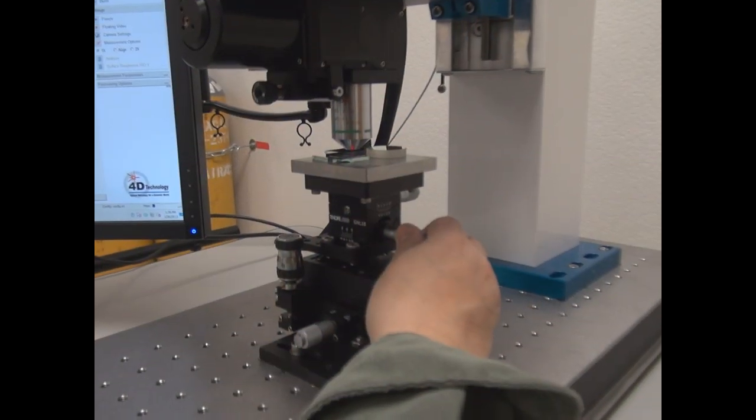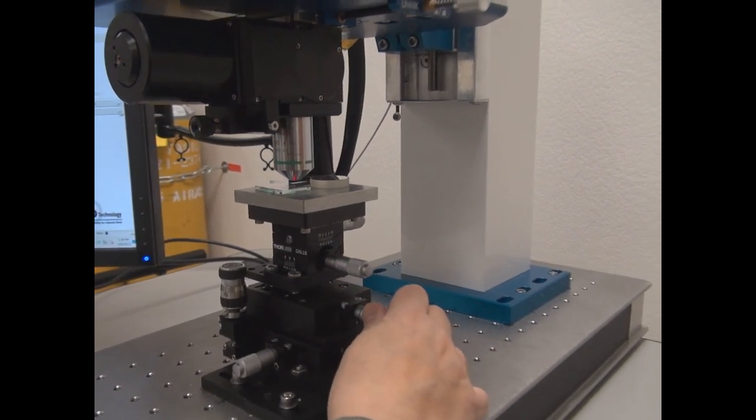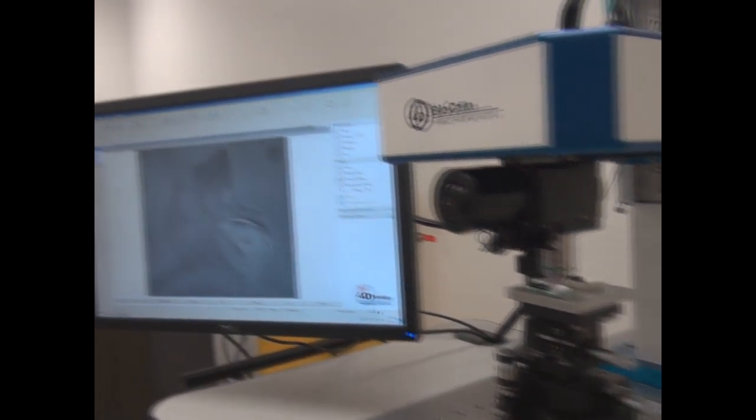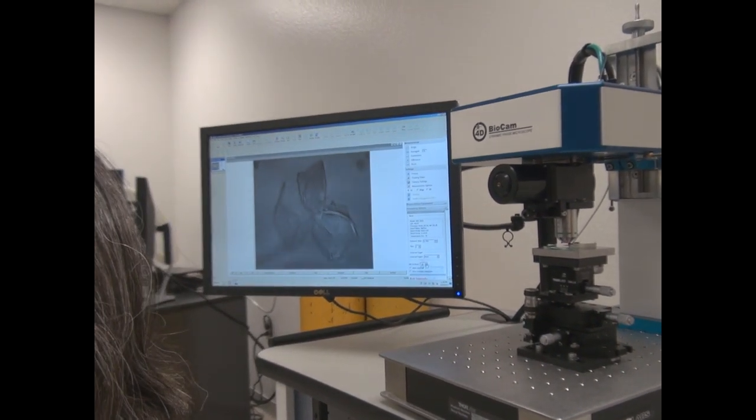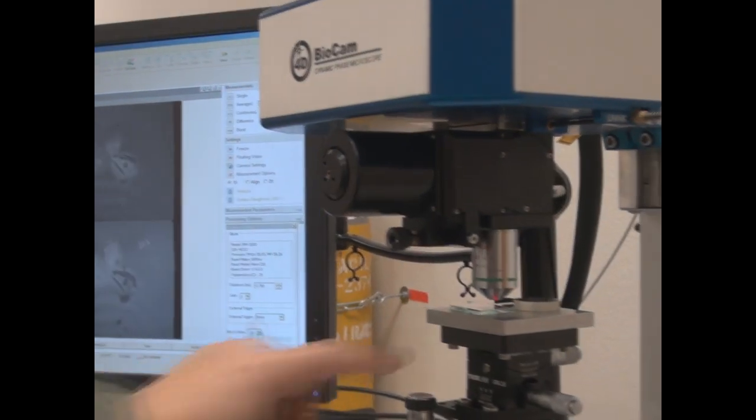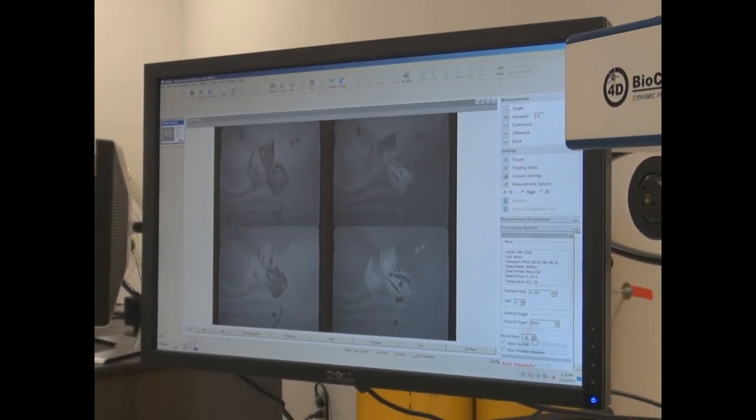I'm putting the sample on the stage and centering it. This is a human cheek cell recently removed from a human. Setting the exposure. What you're seeing is an interferogram and the flashing is caused by a little bit of vibration between this head and the stage. It's just a natural part of the interference - you're seeing motion on the order of a few nanometers.